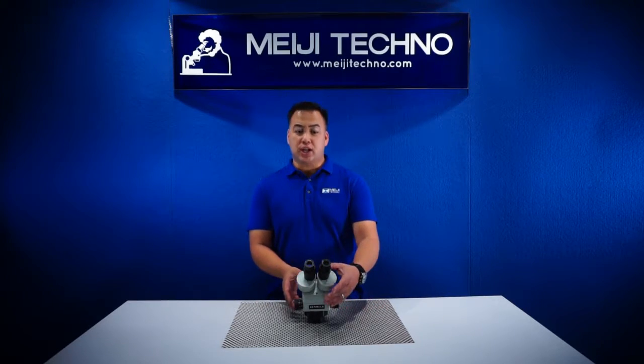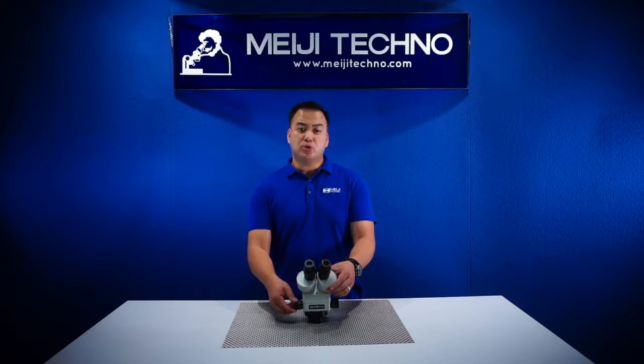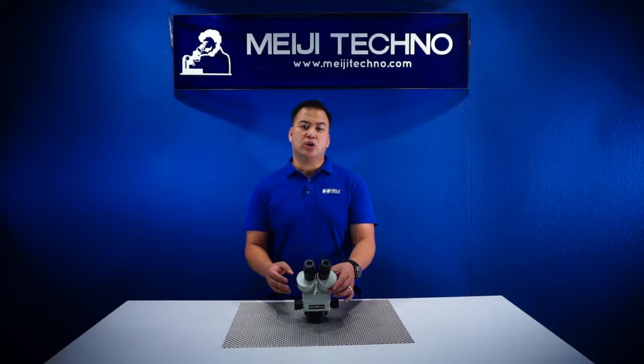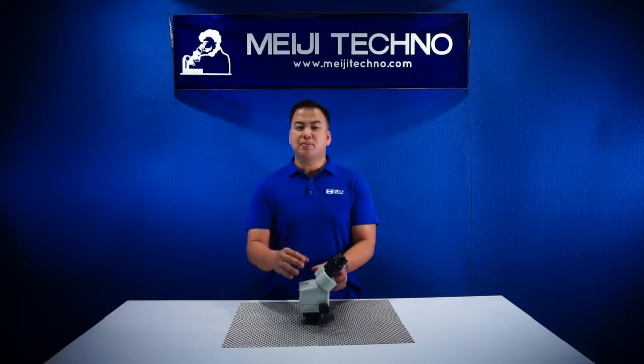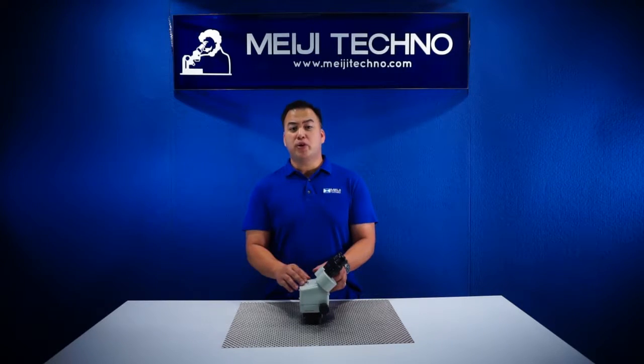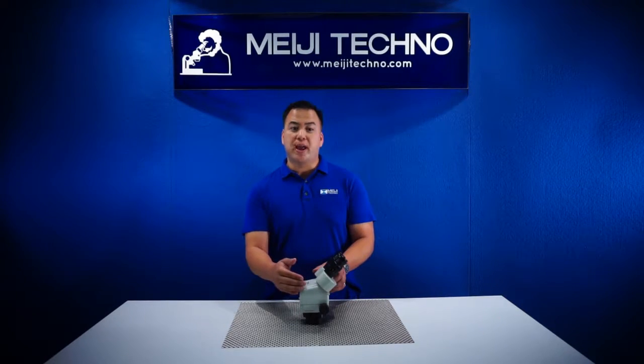From its ergonomically positioned bilateral zoom control and with its binocular eye tubes inclined at 45 degrees, the EMZ-13 provides the user fatigue-free viewing with its ergonomic eye tube angle.